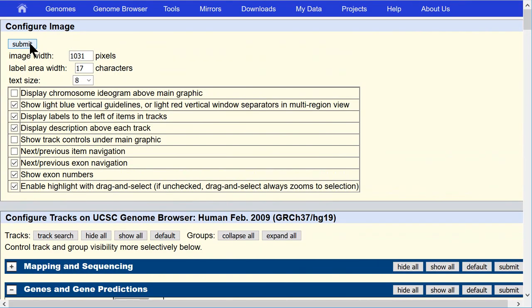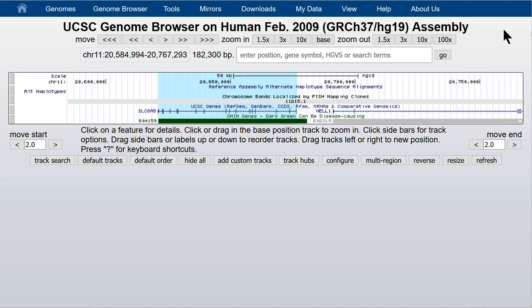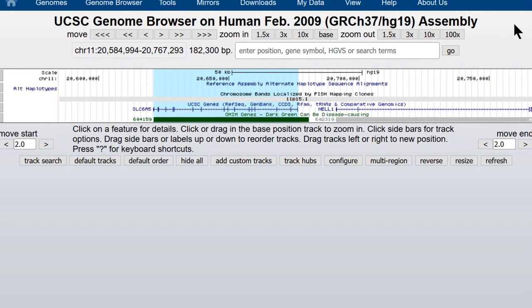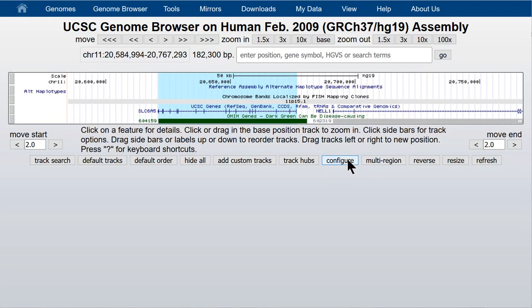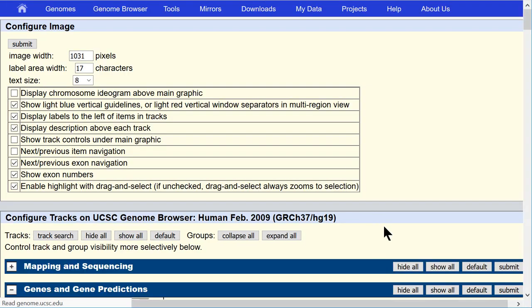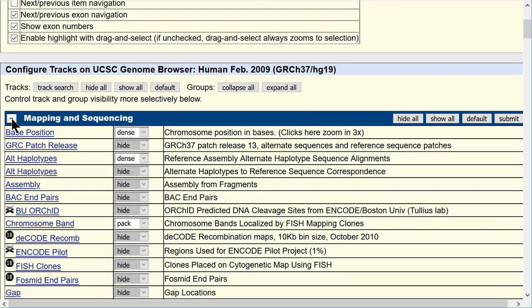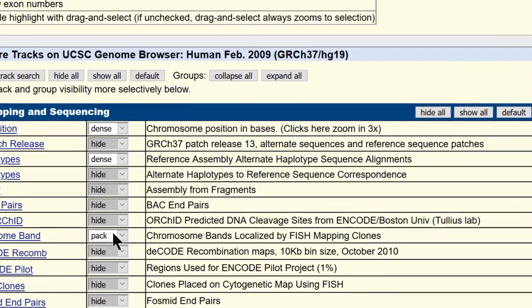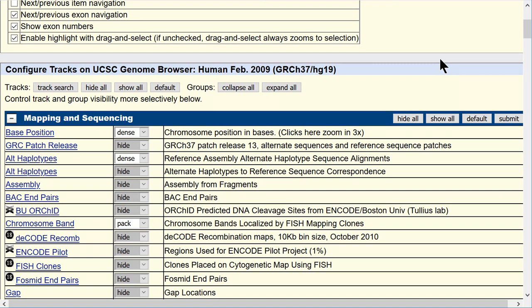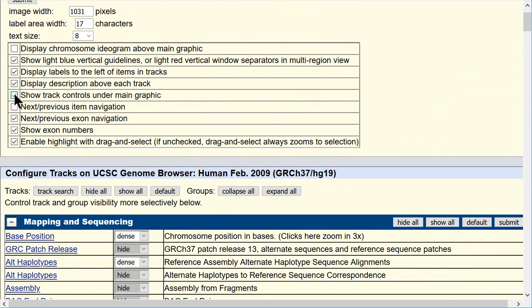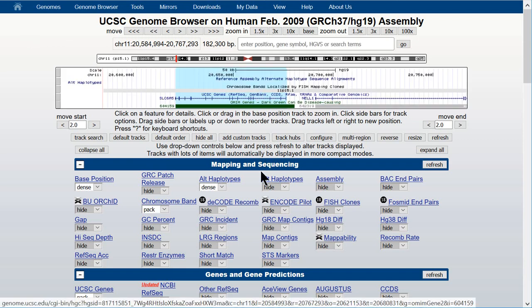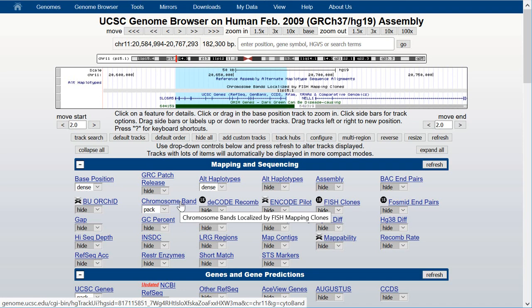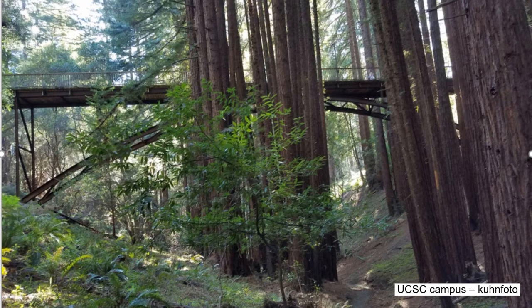Going back to the top of the page and submitting, we now see the browser without the track controls below the browser graphic. Going back to the configuration page, the long label here reads 'Chromosome bands localized by FISH mapping clones,' which is also visible in the track controls on the configuration page in the mapping and sequencing group. The track is turned on to pack. After turning the track controls and ideogram back on and hitting submit, you can see the long label in the image, and it's also what you get when you mouse over the label above the track control pull-down menu below the browser graphic.